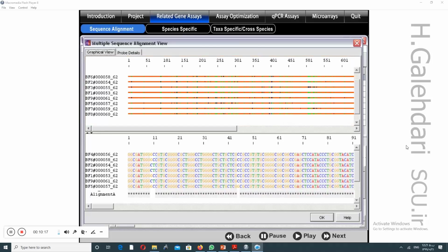The upper pane of the Graphical View tab depicts the entire set of sequences. The lower pane shows the base detail at your cursor position. In the upper pane, the conserved regions are orange, moderately matched positions are green, moderately mismatched positions are black, and unique positions are blue by default. Asterisks in the bottom row indicate conserved positions of the alignment. Right-click anywhere in the graphic to change the zoom and colors.